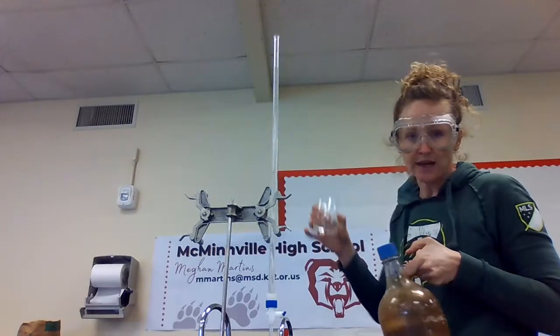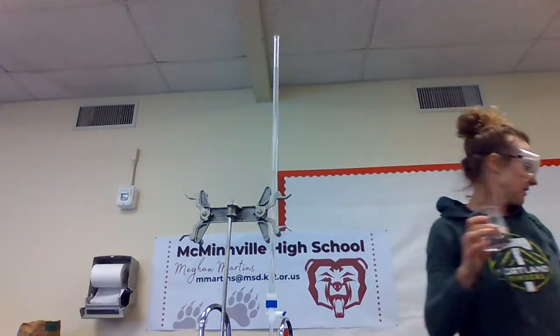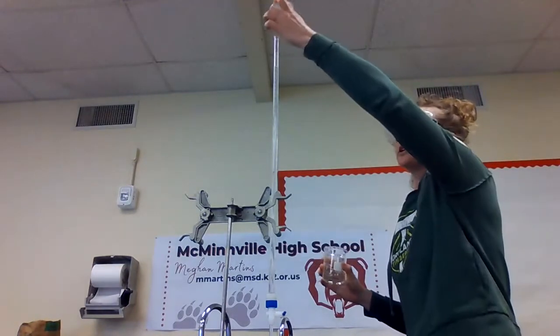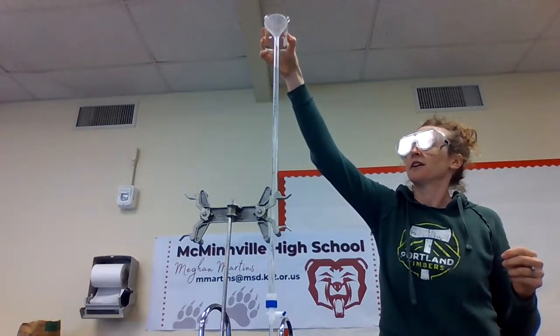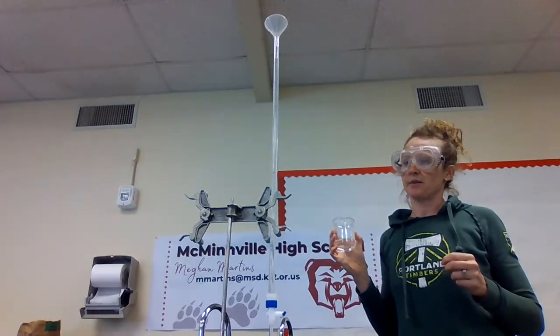You don't want to do that. Always pour into a smaller, more controllable container first. Also, when you pour into a burette, you want to use a funnel, and be careful because the funnel is going to drain slower than the burette actually fills up.